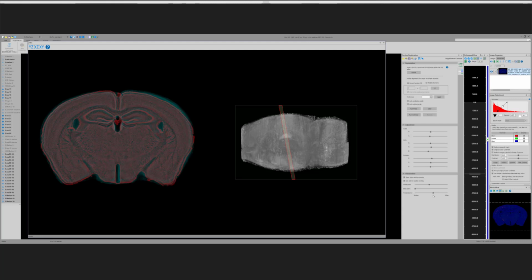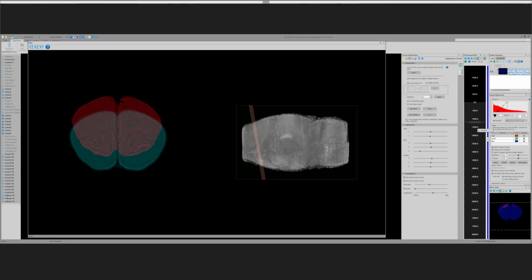Yeah. So what we're doing is trying to find the best fit for this one. And then the idea is that if we can find this, the same offset should be able to be applied throughout the whole brain. And so the next part of what we do is we see, okay, can we apply that offset to other levels of the brain? So we'll go rostrally, maybe that's a little too rostral.